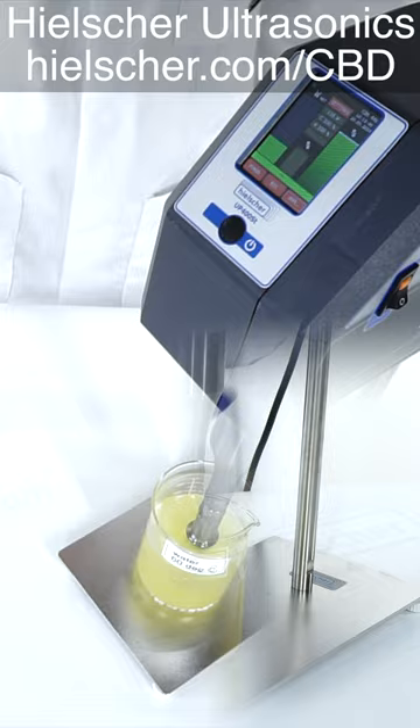After less than 3 minutes, we have a nice, uniform, and translucent nano-emulsion.